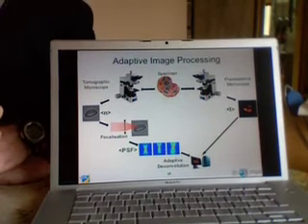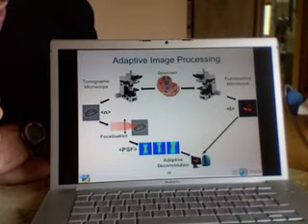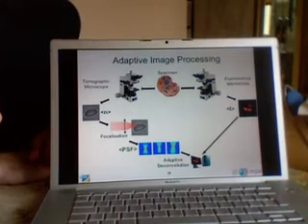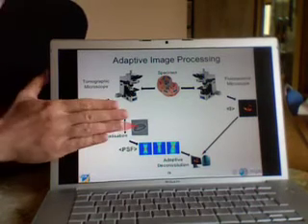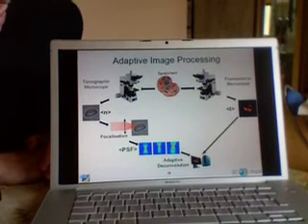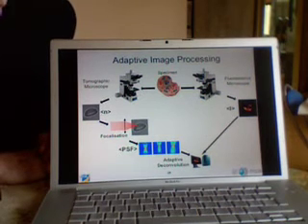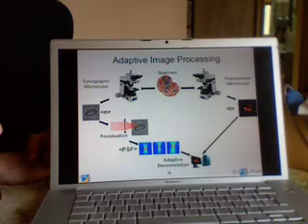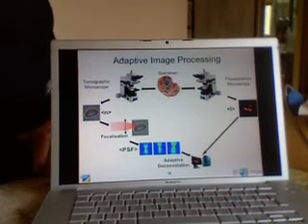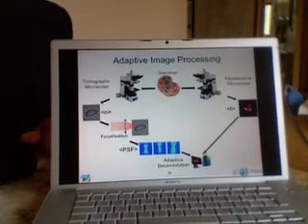The idea is mostly to improve the resolution, and we have made proposals to directly get better images in fluorescence microscopy, maybe without having to use the tomographic microscope, which is also a technique which combines image processing and some hardware modification of the microscope, which we call subtractive structured microscopy, or saturated subtractive structured microscopy.